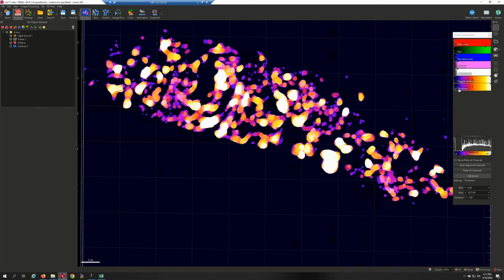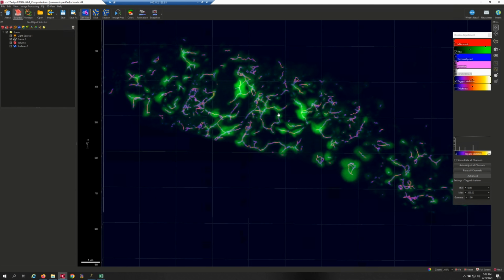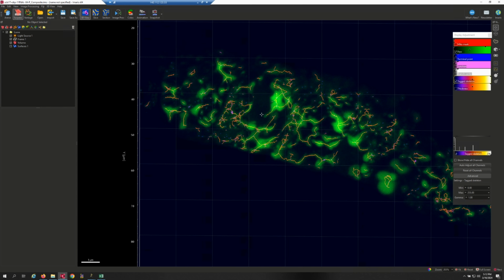Alright, now it basically looks like I'm doing it this way, because after all, we wrote the program ourselves. So we need to check it this way. Our current program is whether the numbers on both sides are correct or not. Alright, you can check each file like this. But basically, I've already checked these 4 files, and they seem to have no major issues. Now, let's take a look.